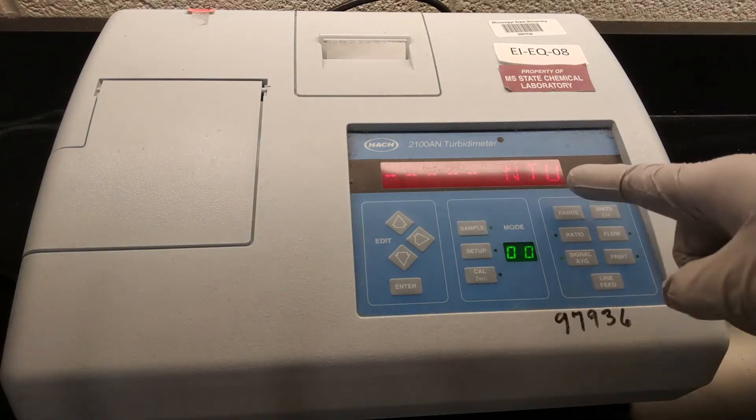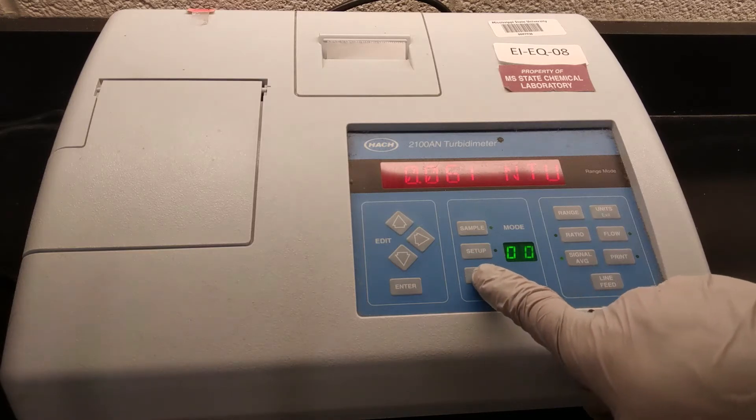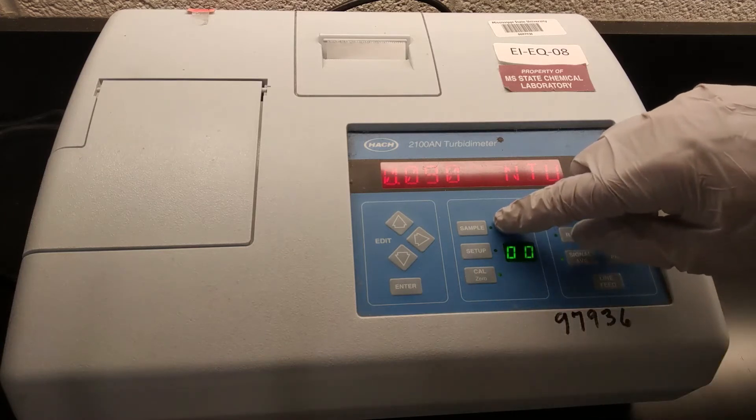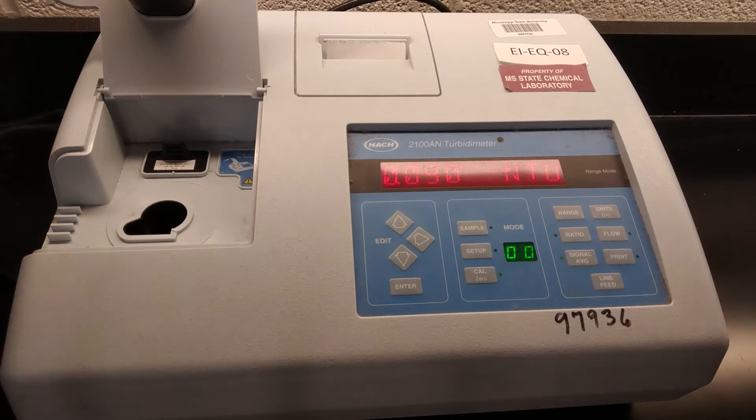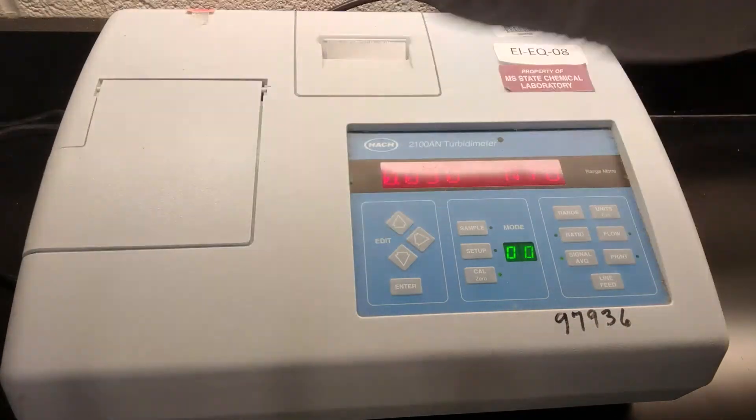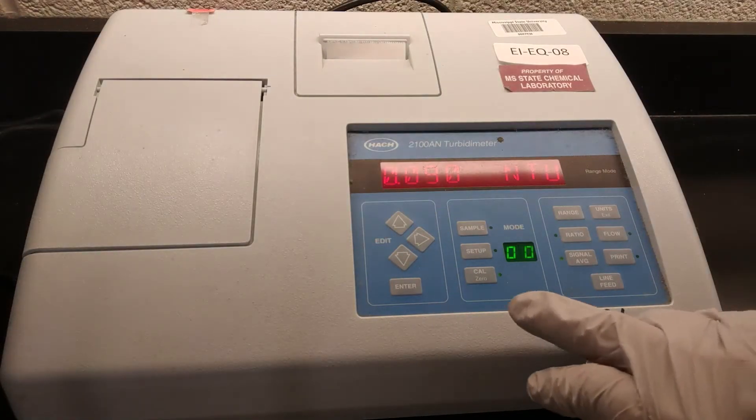So when you see this show up on the little screen, the dashes and then NTU, that's how you know it is about ready to get started. Now it's measuring. It's saying in the cell, I'm seeing 0.061 NTU. So to calibrate, we want to hit this calibrate button. You can see the LED switched from sample to calibrate. And then we're going to put our low standard in, being careful not to touch the sides, close our bay door and calibrate.